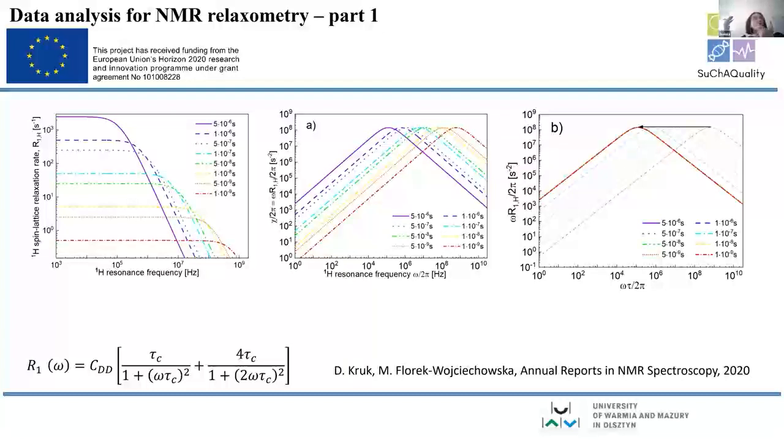So you see, for instance, if you have three-dimensional diffusion, which is completely isotropic in your system, this concept assumes that even if you cool down the system very much, it's not that, for instance, the diffusion becomes more restricted or something like that. It still assumes that the molecules can freely move in all possible directions, but only slowly. So this is a kind of controversial concept. However, just so you know, people do such things, and it's worth trying to see whether maybe your system really behaves like that.